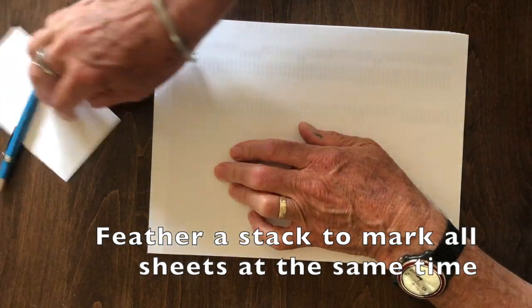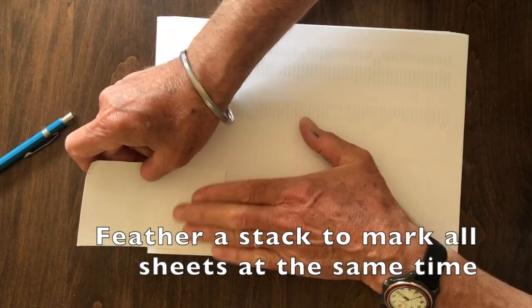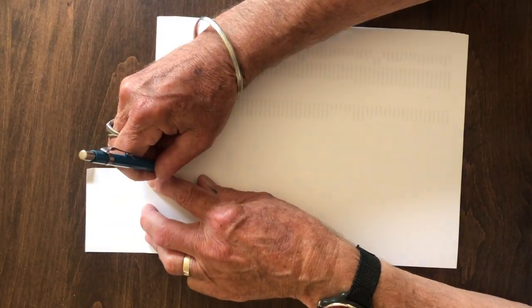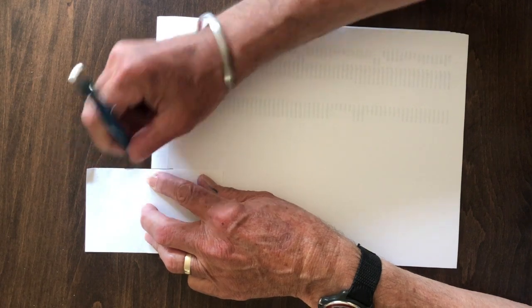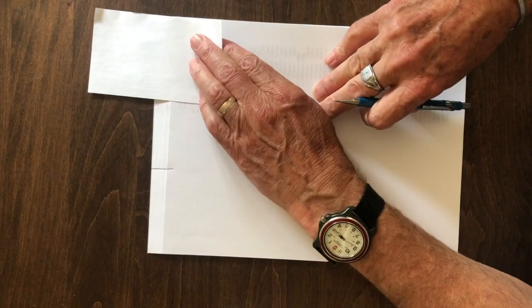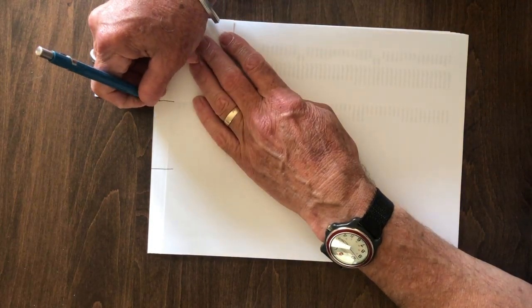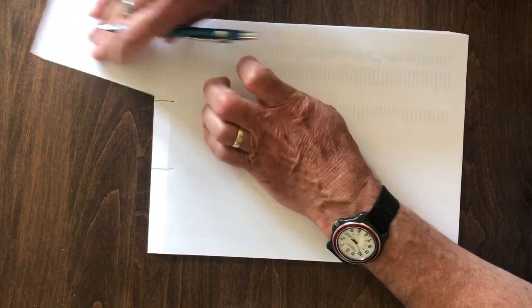One of the reasons for using a card is because you can bend it down and make a nice mark, and there'll be a mark on the whole stack of paper. Then do one on this side as well — you're making marks on all of the paper, maybe 20 sheets in there.